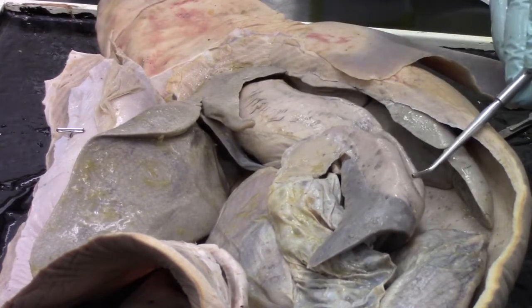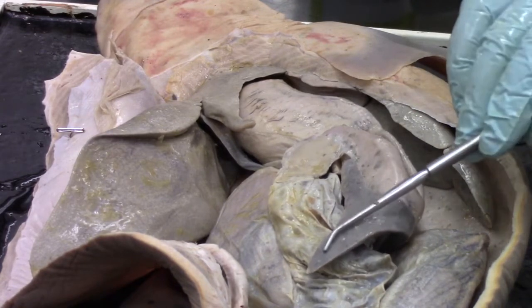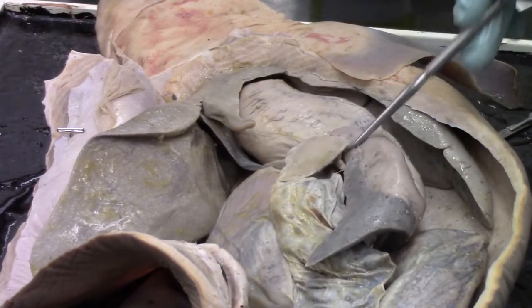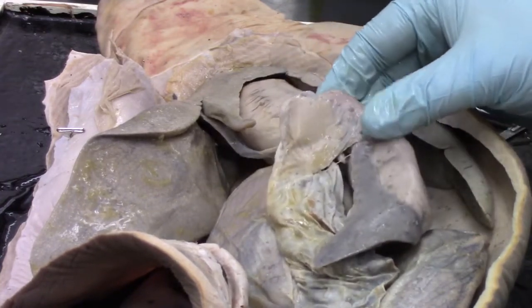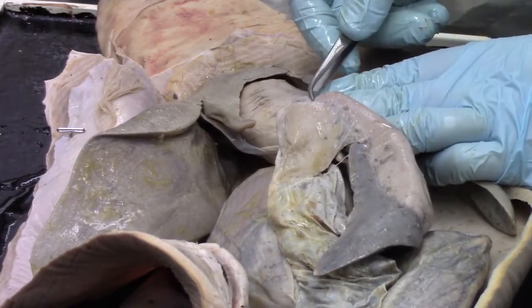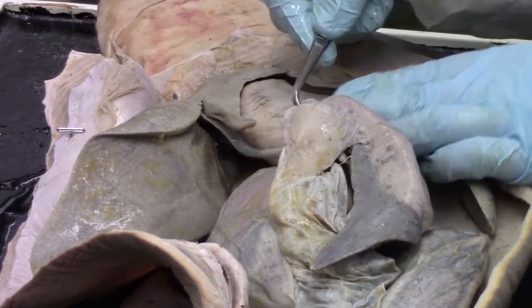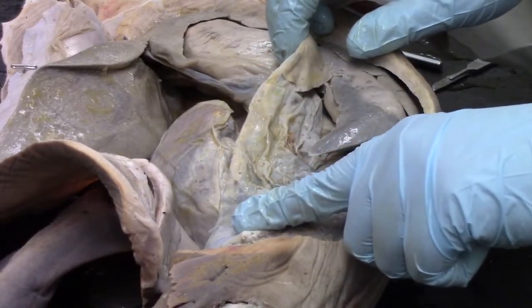We then go into a kind of J shape on the stomach. At the bottom of the J is where we find our spleen. And then as we go back up, here we've got our pancreas. That's nice and visible. And there we've actually got our pyloric sphincter as well. So that's that little narrowing between the stomach and the duodenum. From the duodenum, we make our way into the spiral intestine.